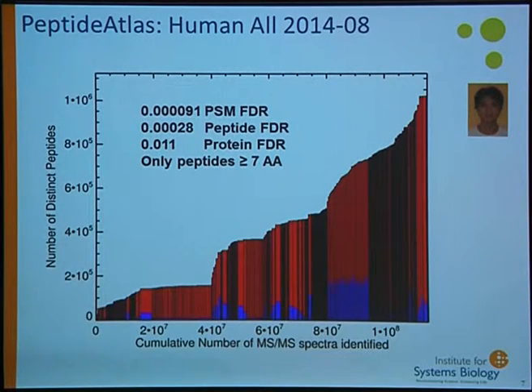But you can see here in the very recent experiments, mass spectrometry now produces very large quantities of identifications, many of which we've seen already before, but it also produces new identifications which we've never seen before. And that's really the status of the technology as we are at the moment.